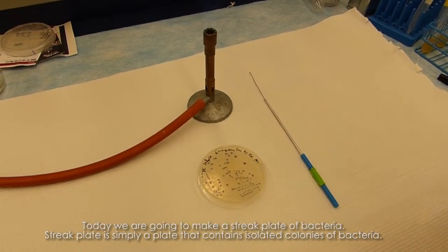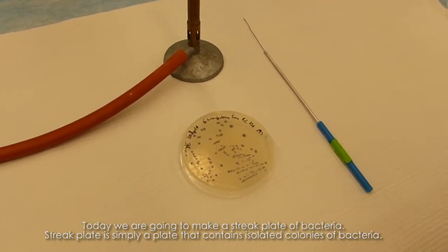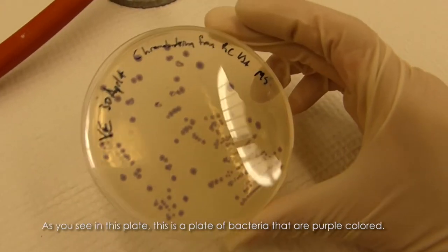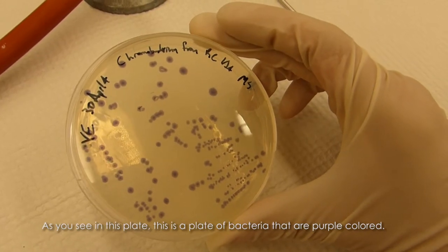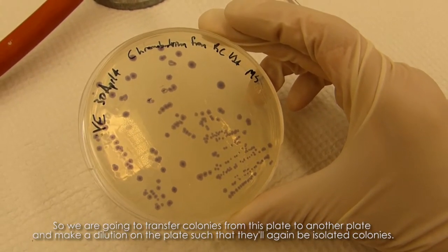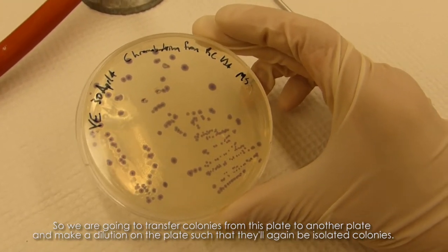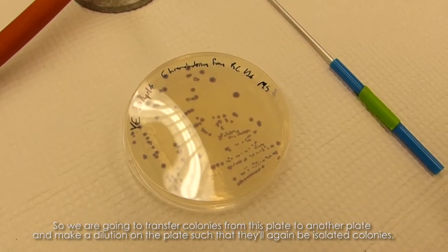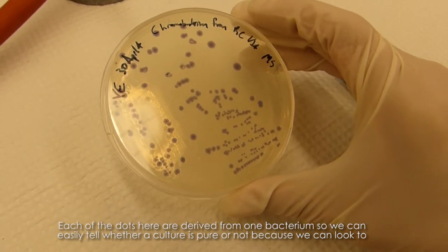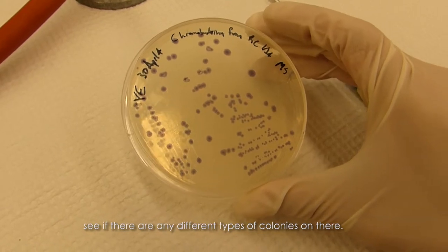Today we're going to make a streak plate of bacteria. A streak plate is simply a plate that contains isolated colonies of bacteria. As you can see in this plate, the bacteria are purple colored. We're going to transfer colonies from this plate to another plate and make a dilution such that they'll again be isolated colonies. Each dot is derived from one bacterium, so we can easily tell whether a culture is pure or not by looking for different colony types.